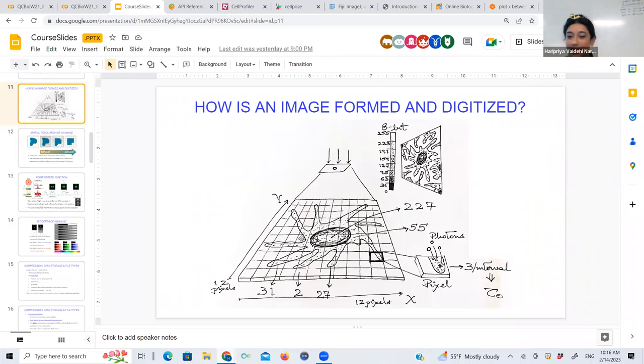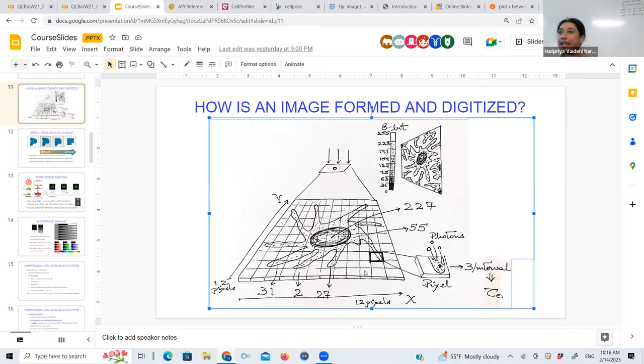Because you see, go back to this image, and I'm showing you this pixel over here, which is technically empty. It should have zero photons, right? Nothing in this world has zero photons. You're going to have some thermal noise, some scattering, some crap happening here and there, and you're going to get maybe one photon or zero or two or five, some kind of random background noise. You cannot avoid that background noise. You may not see it. Your image may look perfectly dark and beautiful. That doesn't mean the random noise is not there. If it's not there, be suspicious. Something has happened. It is not a raw image, okay?